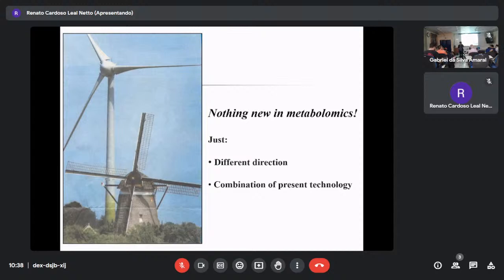In that case, always the Brazilian group extracts the sample with methanol. Then, as long as you have a certain number of extracts, for me it's very fine. As long as they use the same extraction, methanol or methanol-water, whatever, then it's okay. You can use it. But always keep in mind, some extracts have a limited lifetime, so they can rot or not.